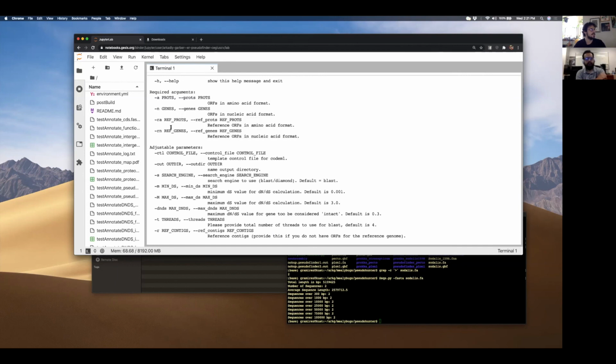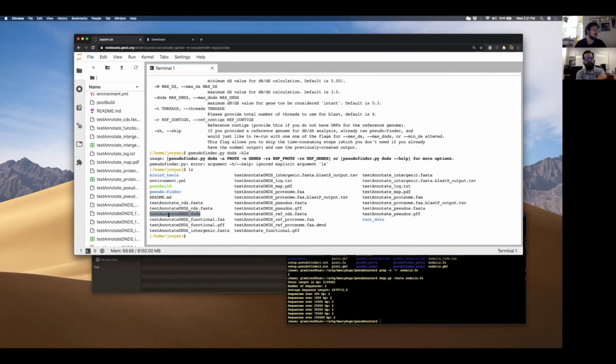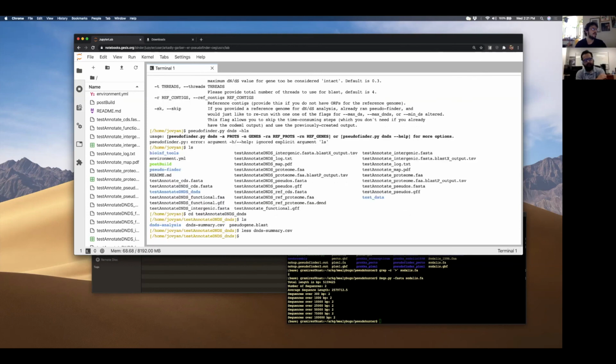It's going to do the analysis and provide you with just this one directory that will have this output. You can run this on multiple genomes and then compare the output and see if there are any patterns. If you have one query genome and 10 references, and one gene always looks like it's under neutral or positive selection, with high DNDS relative to all of them, then that will add to your confidence that something is going on with that gene.